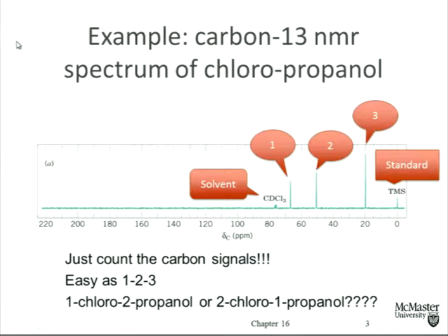Okay? Not a good idea, because I guarantee you none of the compounds I give you in this course will have silicon in them, or phosphorus, or a whole bunch of elements in the periodic table, because most organic compounds contain one of a few elements, right? We've seen that already. They contain carbon and hydrogen, nitrogen and oxygen, sometimes sulfur. Occasionally things like phosphorus, which I won't give you, chlorine, bromine, atoms that we learned to recognize, and we can tell whether chlorine and bromine are there in an unknown compound. How? Mass spec, right? Because they have those signature patterns in the mass spec.